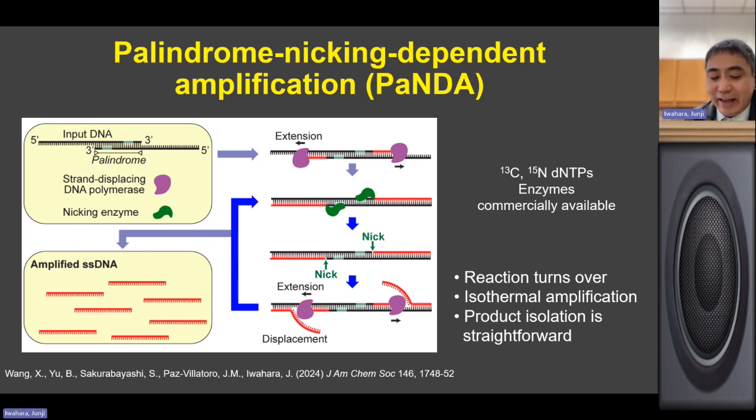In that case, you see shorter products. But usually, even then, we can chromatographically isolate the desired product because the shorter product comes out earlier in the chromatography. But anyway, the specificity of the nicking enzyme is something we could address, or some companies like NEB can address. So if a high fidelity nicking enzyme becomes available, that would be useful for us.